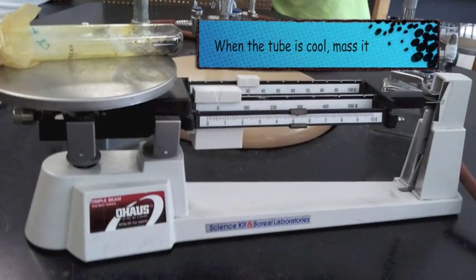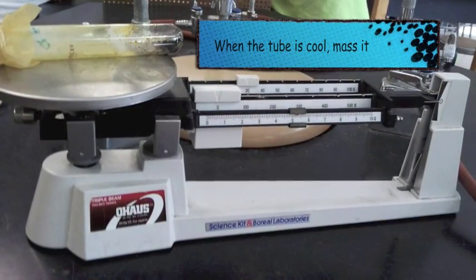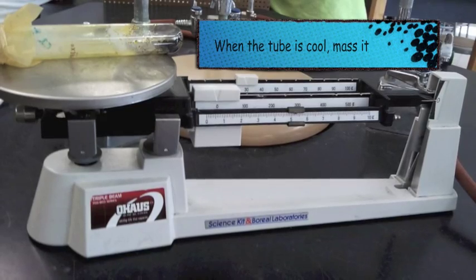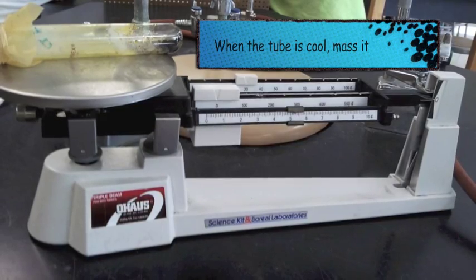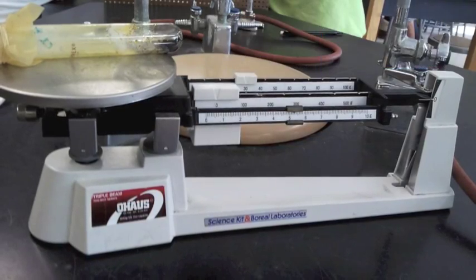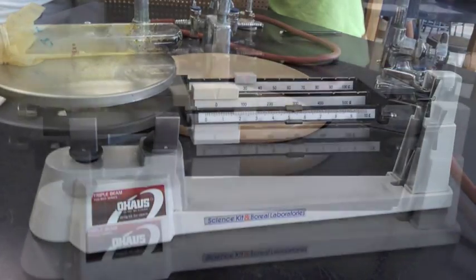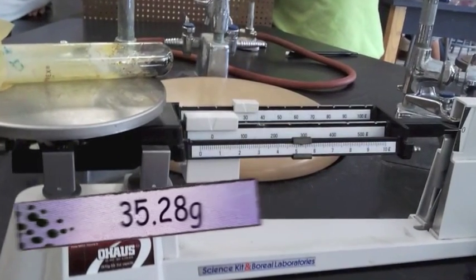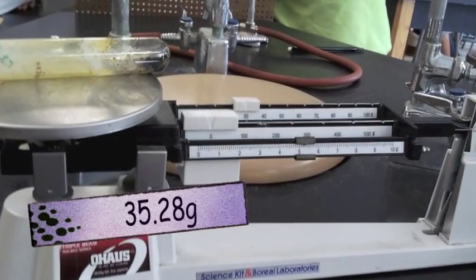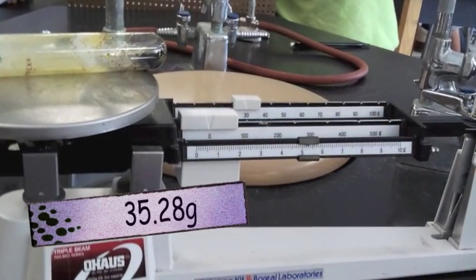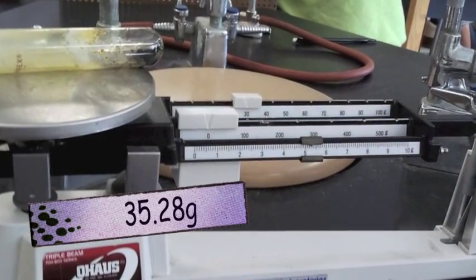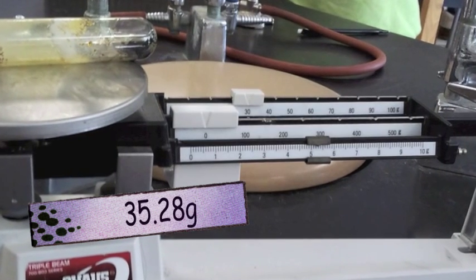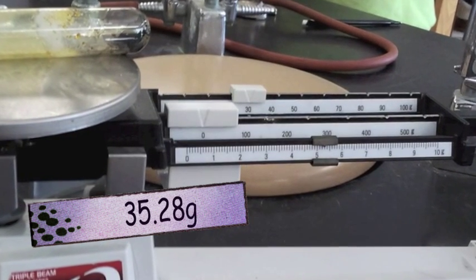Once it cools, the test tube that is, we're going to mass it again to see if we lost any mass or if we gained any mass. And the mass, as you can see, is 35.28 grams, so we had no change.